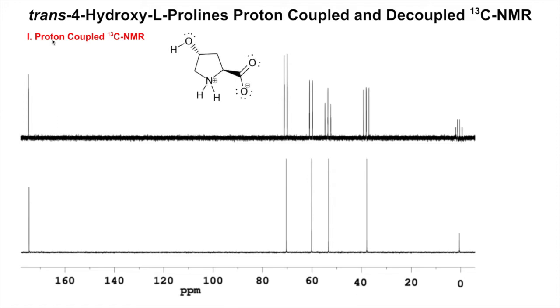So here first is the trans-4-Hydroxy-L-Proline, and you'll see I have a negative charge on what could be the carboxylic acid, but it's a carboxylate, and then I have a positive charge on the nitrogen here, the ammonium, which you think of amino acids. This is an amino acid as an amine and an acid, but what will happen in normal situations, the nitrogen will be protonated, so it won't be an amine, it'll be an ammonium, and the carboxylic acid will be deprotonated, so it'll be a carboxylate.